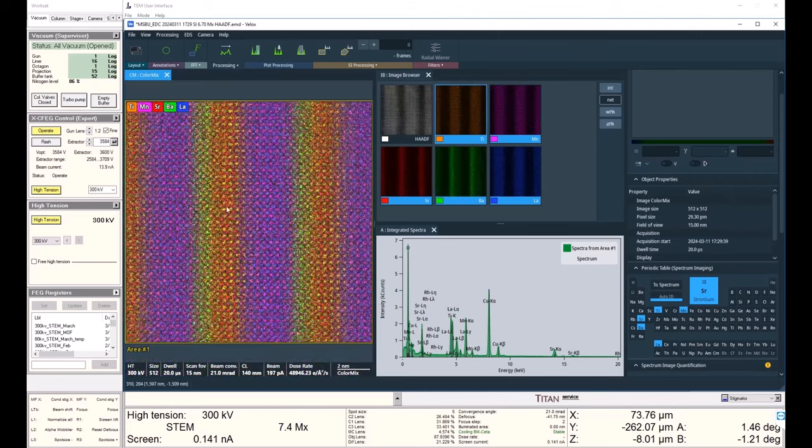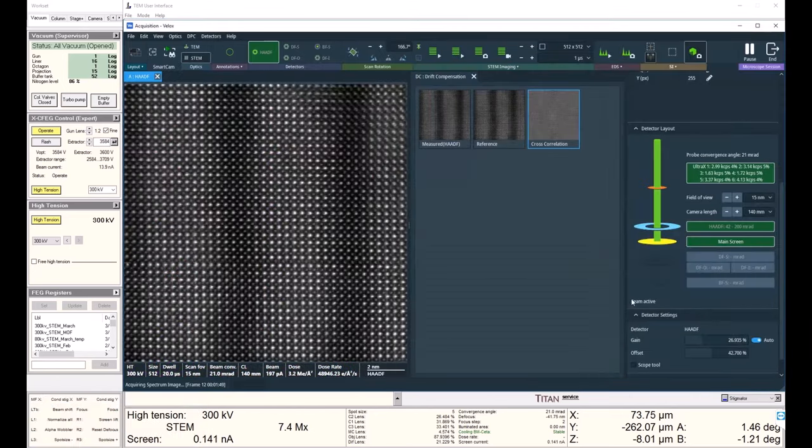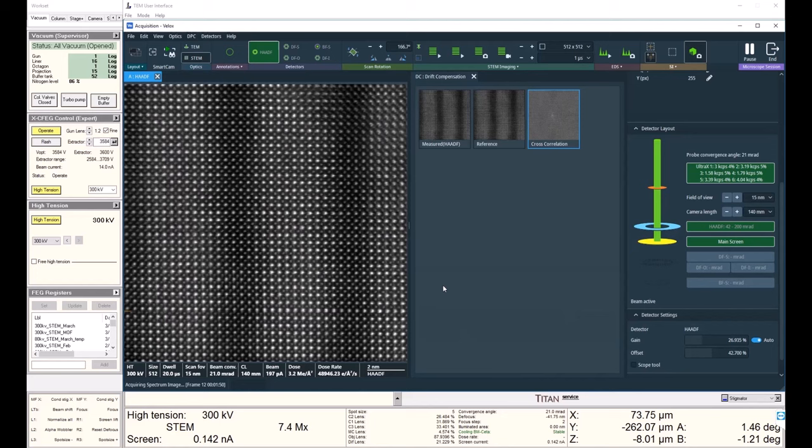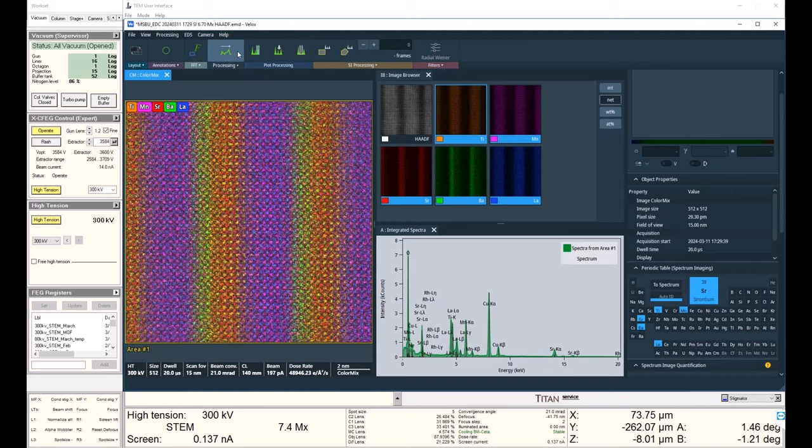And we've only been acquiring for two minutes, and we're already seeing all of our atoms. I'll let it acquire for a few more minutes. In the meantime, we can also put down a line profile.